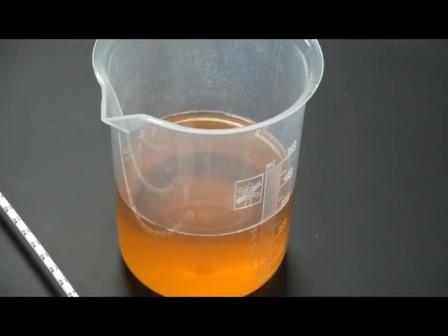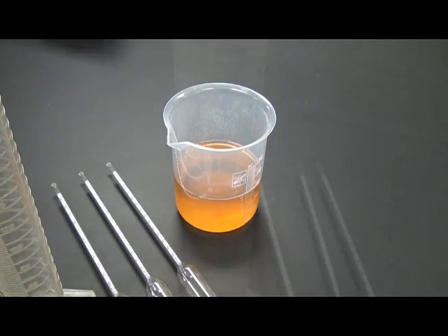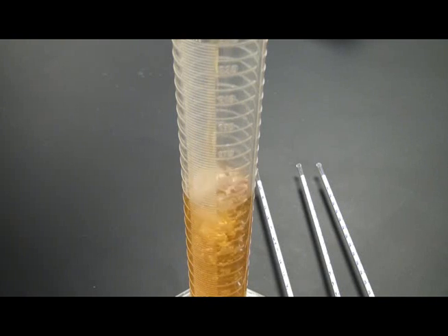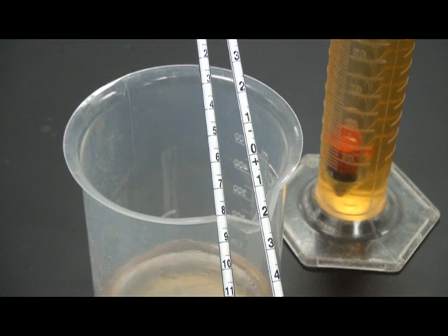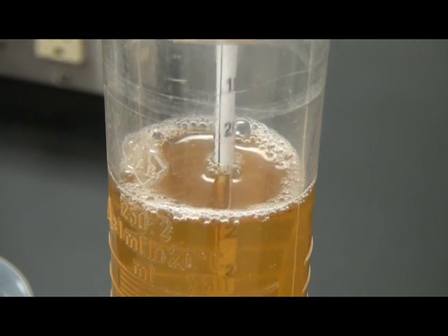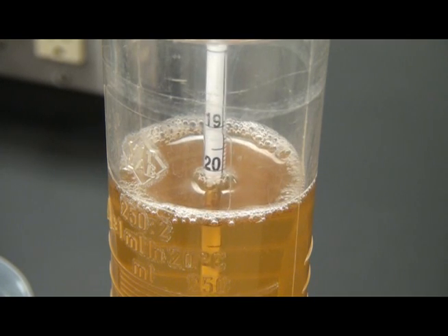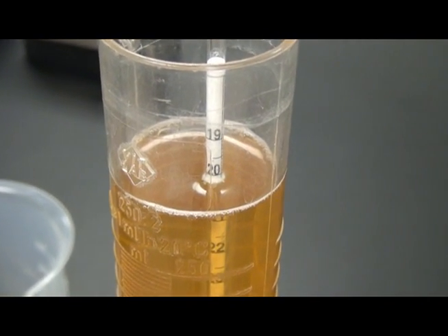Testing a juice or wine sample using a hydrometer requires a larger product sample of 150 to 200 milliliters. Place the strained and settled juice sample into a 250 ml graduated cylinder. Select the appropriate clean hydrometer for the anticipated brix level, as hydrometers have unique scale ranges. Place the hydrometer into the cylinder containing your juice sample, giving the hydrometer a slight spinning action. Allow the hydrometer to stabilize in the sample before taking a reading. Record the hydrometer reading where the hydrometer scale point is in contact with the sample in the graduated cylinder.